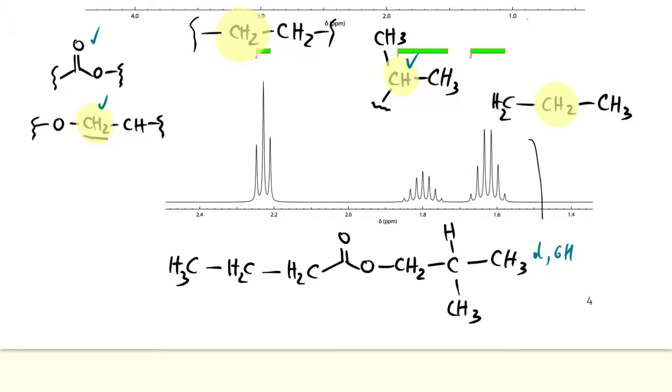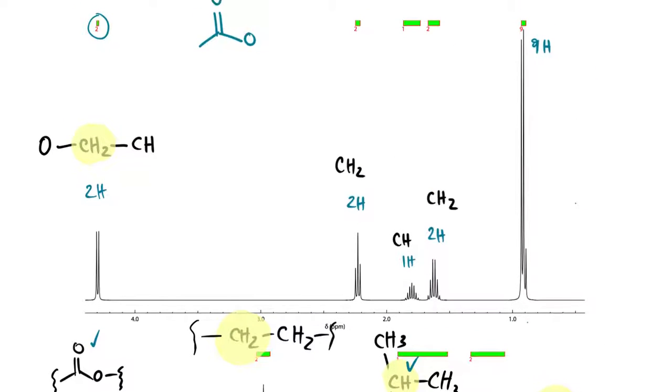If you go back to the big spectrum, the peak that we had for 9 protons is actually our doublet for 6 and our triplet for 3 on top of one another. You can see there's actually one end of it that has something extra. Okay, so that will happen if two protons have very similar environments. That's the drawback of proton NMR. Sometimes the data will just overlap. The resolution isn't good enough. Okay.